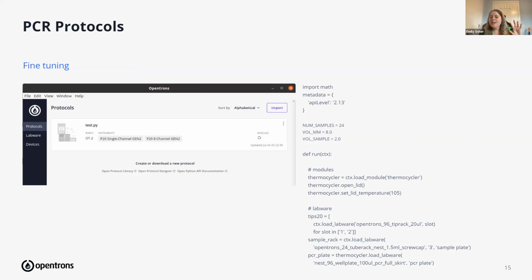And then you can use that to do interesting things like find the distance between two embeddings. So one of the things that we'll do is, for example, if we have 100 samples, then we'll hold 10 of them back and fine-tune with 90 of them. For the last 10, we know what the protocol should ultimately look like. So without having trained on those 10 prompts, we'll stick them into ChatGPT and then measure the distance of the embeddings that's shot out versus what we expected them to look like. So that's an example of something that you can do here.